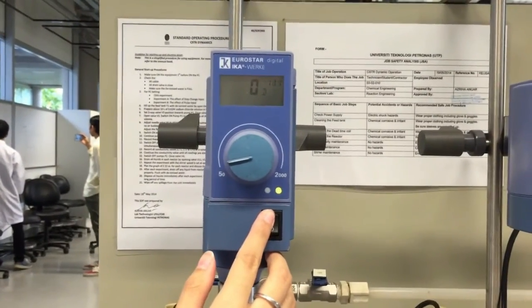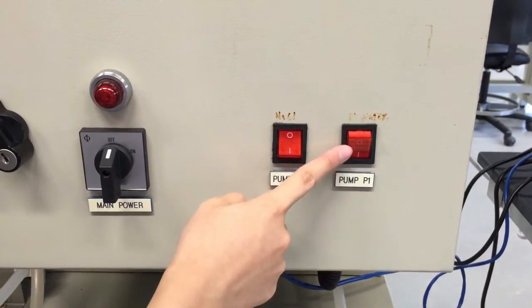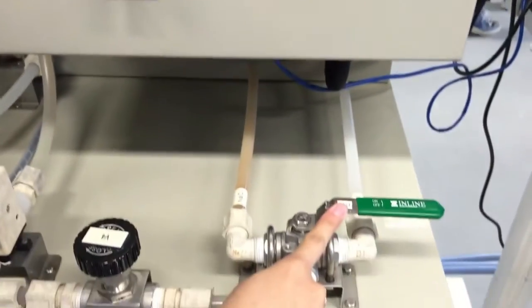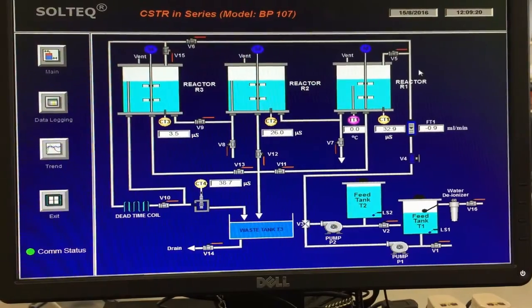Pump P1 is switched off and valve V3 is quickly set towards pump P2. Pump P2 is switched on and start the timer simultaneously.